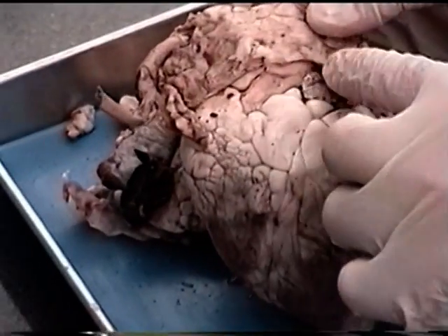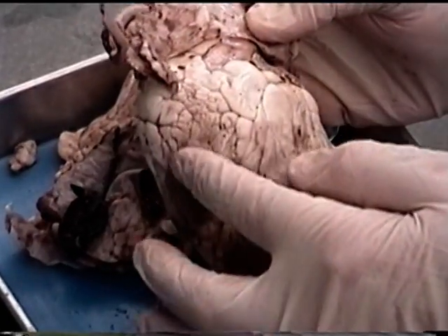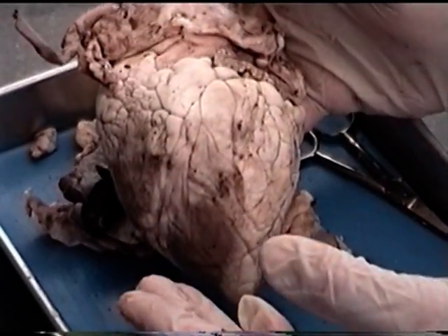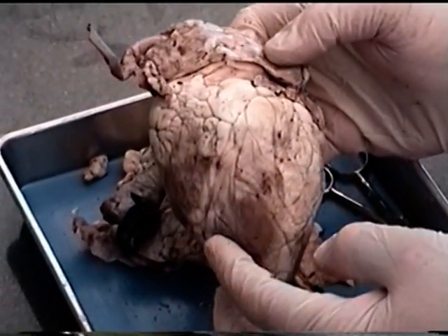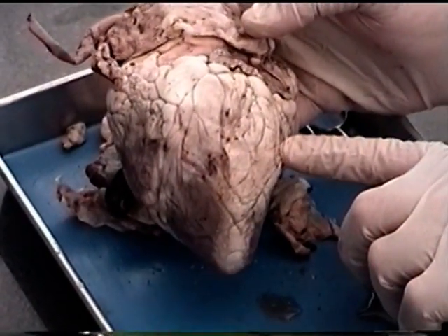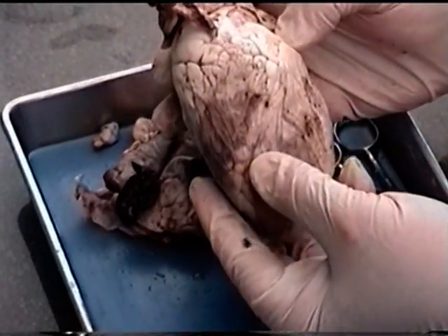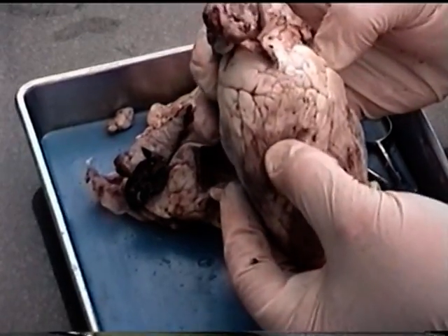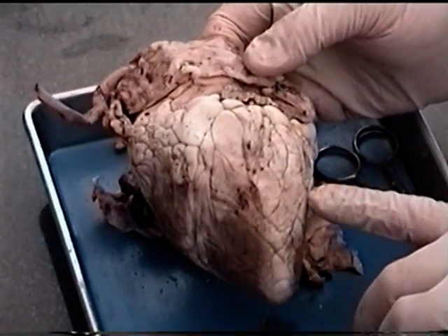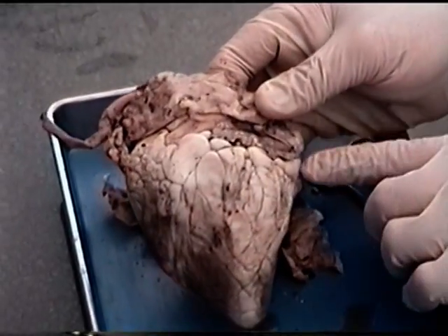Since this is the anterior surface of the heart and the pulmonary trunk arises from the right side, that tells me that this is the right ventricle over here and the left ventricle over here. Another trick for that is to recall that the right ventricle myocardium is thin, the left ventricle myocardium is thick. If I push on this side of the heart, there's very little give. When I push on this side of the heart, there's more give to it. So I know that this is my right ventricle over here. If we can define our ventricles as right ventricle and left ventricle, then we can begin to understand the surface anatomy of the heart.